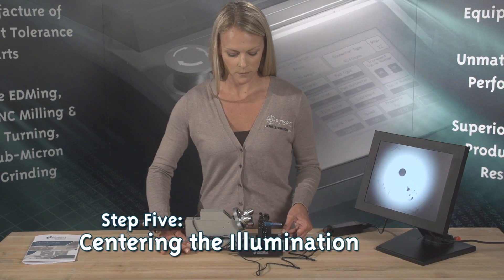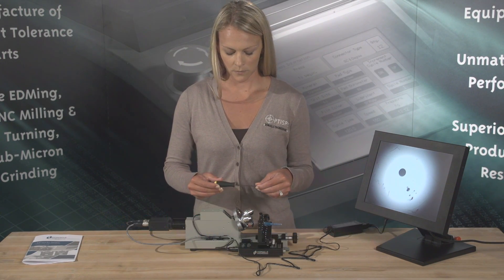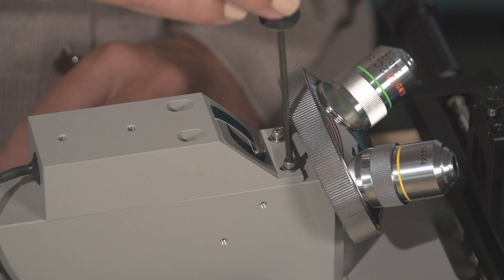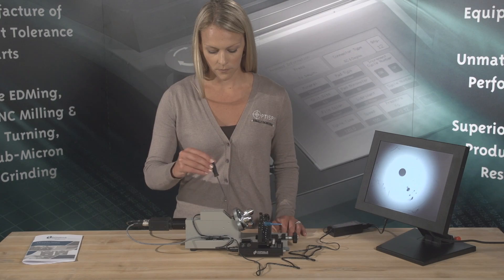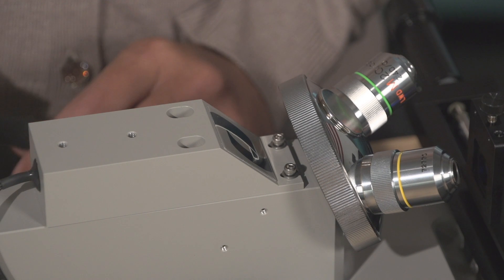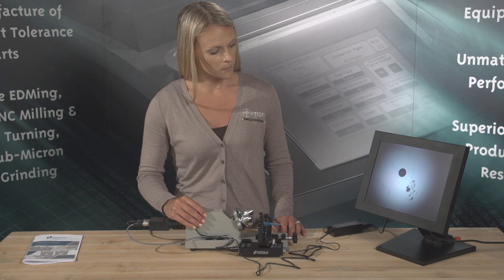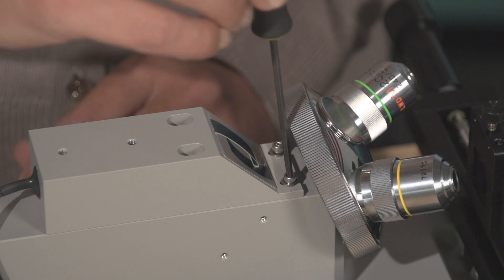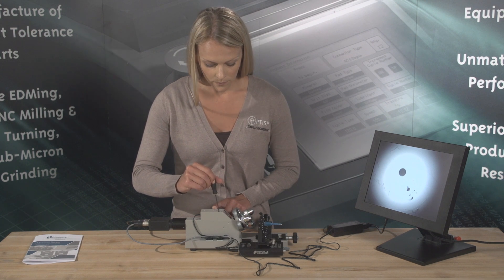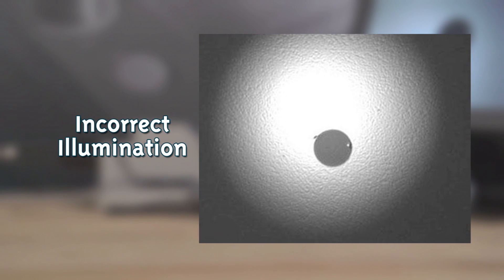Step 5: Centering the Illumination. All scopes are set up from the factory, but replacing lamps or periodic cleaning of the beam splitter may require the operator to re-center the illumination. Centering the illumination of the DE2503 is critical in order to maximize performance of the microscope. To re-adjust the illumination position, do the following: using a 3/32 hex wrench, loosen the four socket head screws holding the light block. While viewing a fiber on the monitor, slide the light block around until the greatest amount of light is centered over the fiber, then retighten the four screws. Incorrect illumination: notice how the light is towards the top of the screen. Correct illumination: notice how the light surrounds the fiber. Light scratches can now be easily detected.